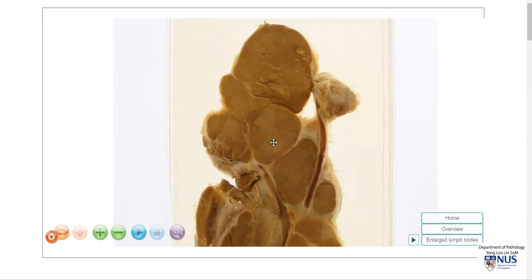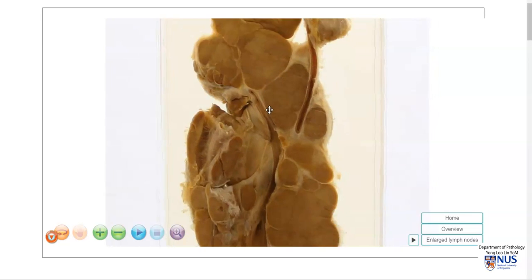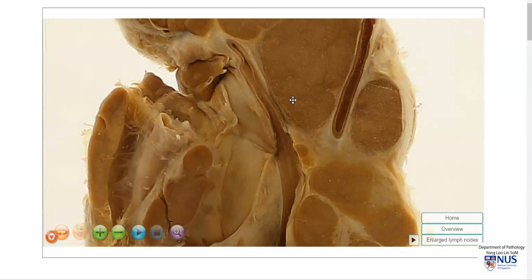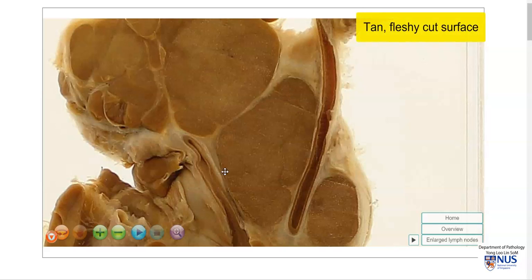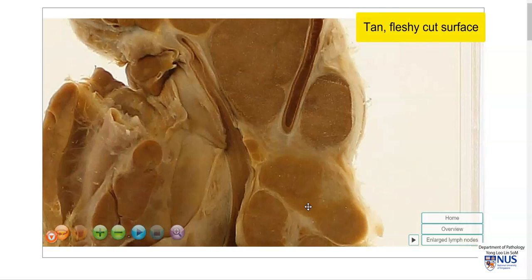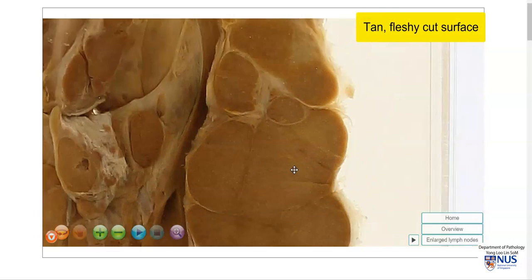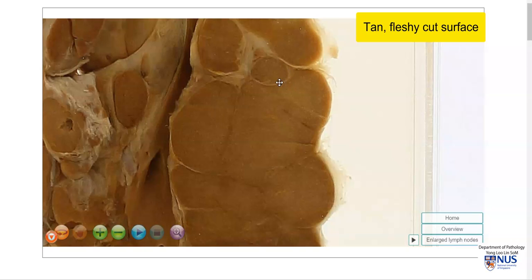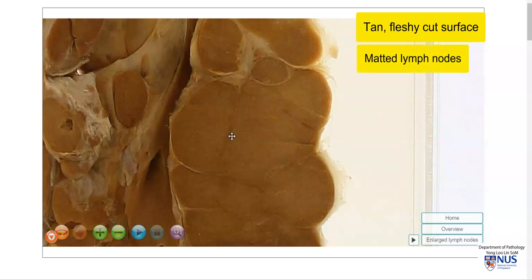So the nodes are extremely enlarged. They have a tan, fleshy cut surface. In some areas, the capsule appears to be less well-defined, and these nodes are stuck together or matted to each other.